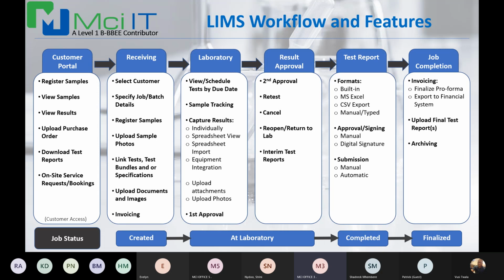Okay, so we were just at the stage of, as tests are being completed in the laboratory and captured in different methods, they are also assessed and approved at that stage, and some results may need to be reported already before the entire batch is complete and so forth. Once the last test on a batch has been completed, it's time for the laboratory to generate the final test report. We allow for multiple formats, and it really just depends on the nature of the laboratory and their report layout. So that is something that's assessed for each and every lead. But yes, you have the generating of the final report, and then it has to be signed and issued to the customer. Or a different department in the organization.